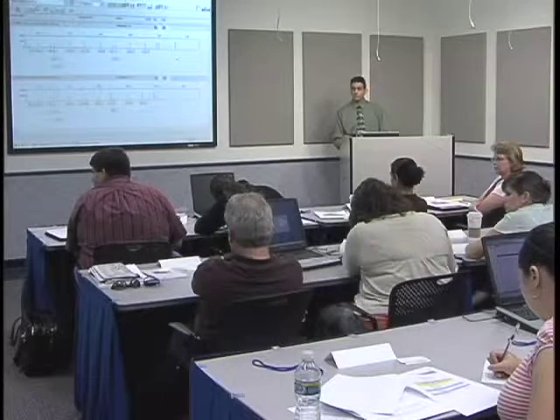What you can do is email our programming department, and they can set up all those variables, because they need to make sure everything will work within the protocol that you might be running. They test all the different variables to make sure it fits into the protocol you want to make those changes to. I'll talk a little bit more about that in my presentation.